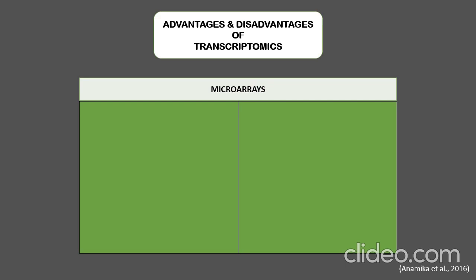Okay, I'm Daniel. I'm back with the advantages and disadvantages of transcriptomics. So I'll be discussing this based on the principles that I've mentioned earlier. So now let's take a look at microarrays.